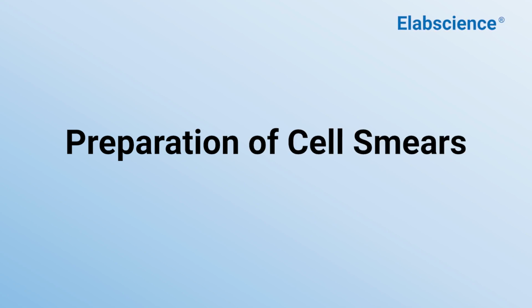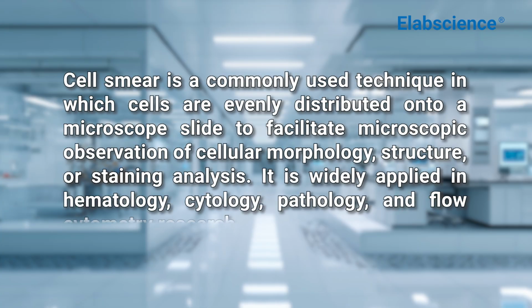Preparation of cell smears. Cell smear is a commonly used technique in which cells are evenly distributed onto a microscope slide to facilitate microscopic observation of cellular morphology, structure, or staining analysis. It is widely applied in hematology, cytology, pathology, and flow cytometry research.